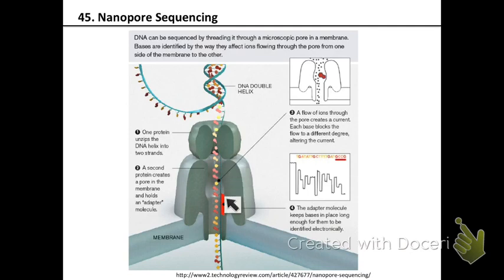All right, so every time the DNA is going in, it's getting pulled one nucleotide at a time, okay? And each nucleotide at the site of the detection is going to disrupt the flow of ions in a stereotypical way. So based on that, which you're going to read here, you can determine what nucleotide was at that site at the time of the detection, right? So you're going to read one nucleotide at a time based on the property of the A, T, G, C bases going through.